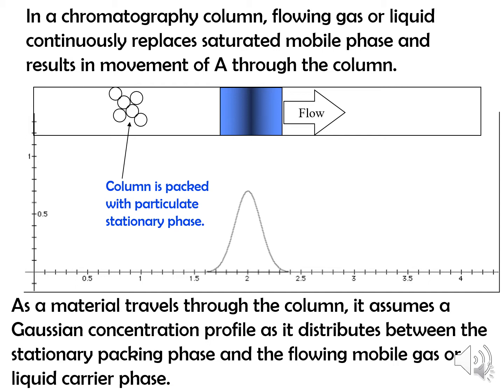They would go through the apple orchard first. The people that like the apples, have an affinity for apples, they'd be tempted and they would have to stop and maybe eat some apples along the way. So they'd be slowed down because they have an affinity for the apples, and they would come out as a second group.